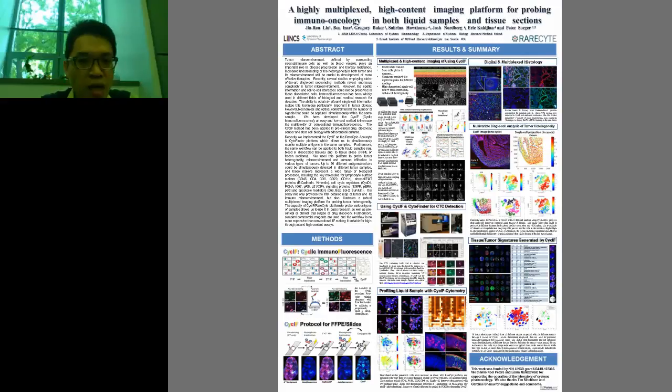But the concept works both in cultured cells, like in here where you can see individual cells done in a 96 well plate, and we can also adapt the same method to the slide. So that allows you to work with tissue samples or clinical samples. And the same concept can apply to all types of tissue or sample. And here on the top is our first result.